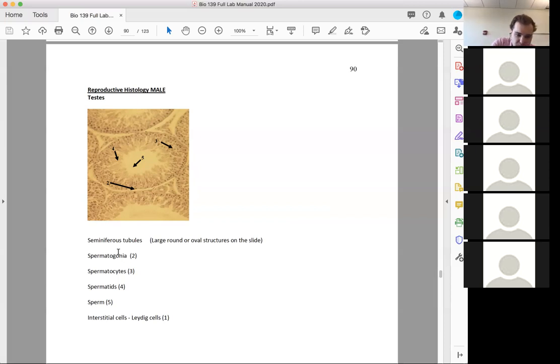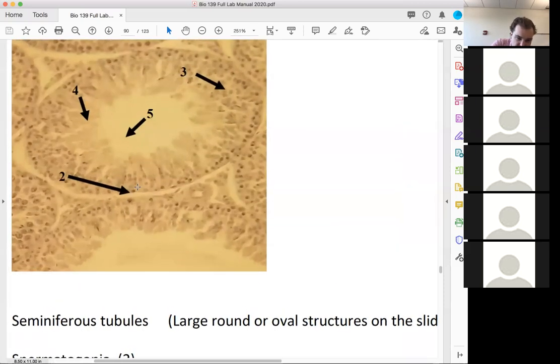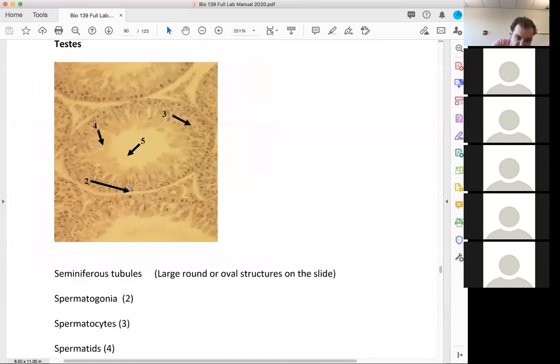These arrows, I'm not sure I quite agree with them, because I think it'd be hard to figure out what you're pointing at. You do have these little germ cells right here. If I want to zoom in right here, then this would be something like a germ cell. These are the germ cells, otherwise known as spermatogonia. Then we get a little bit more mature, a little bit closer to the inside of the testes, and this is the beginning of what we call a spermatocyte. Now, what that is pointing to, I have no idea. You can't see any indication of what this cell would look like.